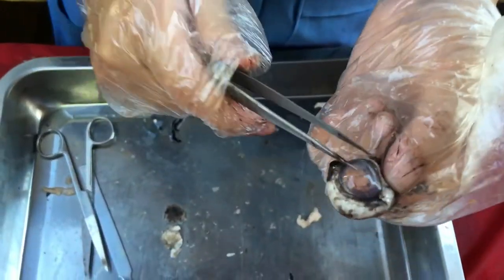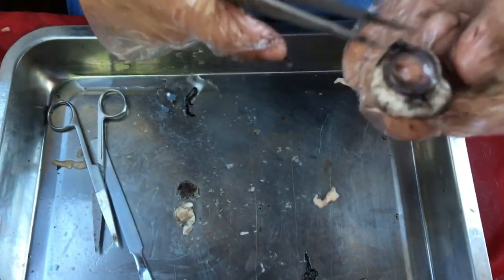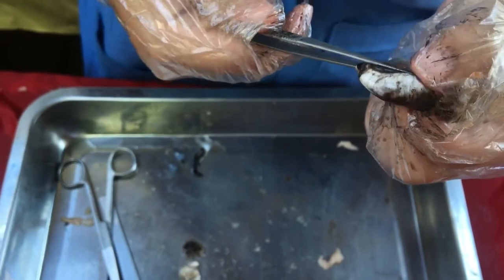The eyes of the pig are very cloudy. It is because it is already dead. But when the pig is alive, the eyes are very transparent or clear.